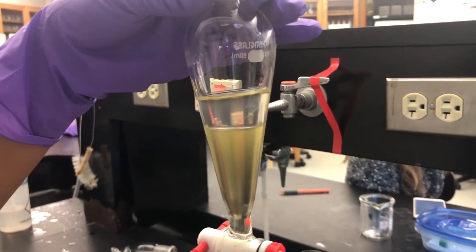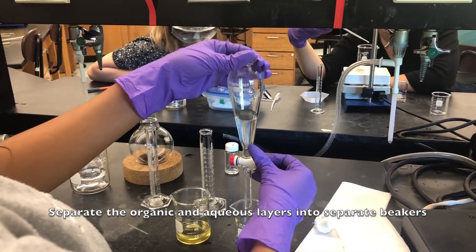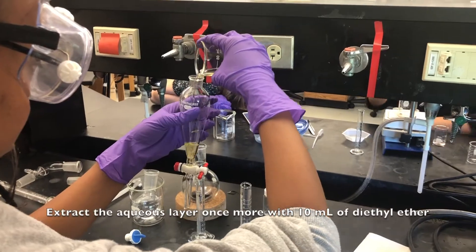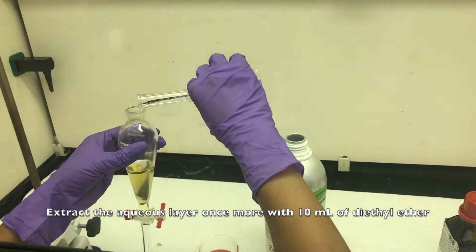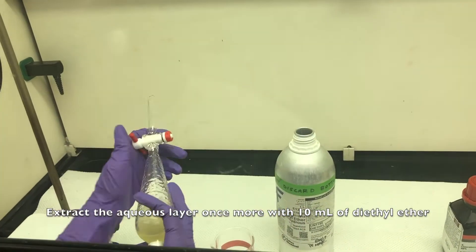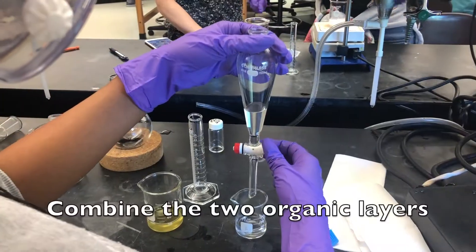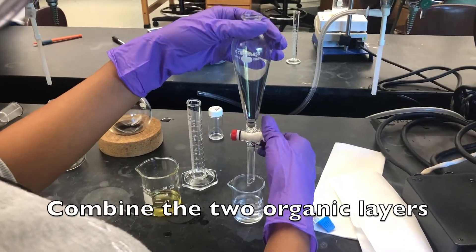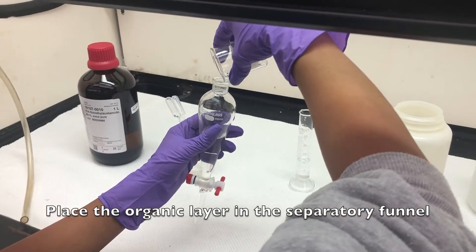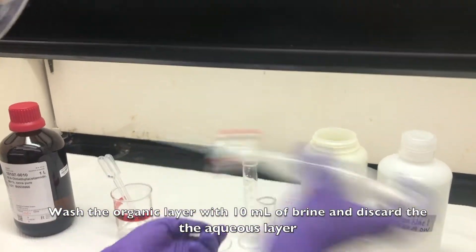You'll be able to see the two layers. Separate the organic and the aqueous layers into two separate beakers. Extract the aqueous layer once more with 10 milliliters of diethyl ether. Remove the aqueous layer and combine the two organic layers. Place the organic layer in the separatory funnel. Wash the organic layer with 10 milliliters of brine and discard the aqueous layer.